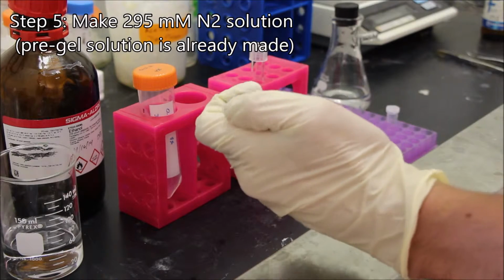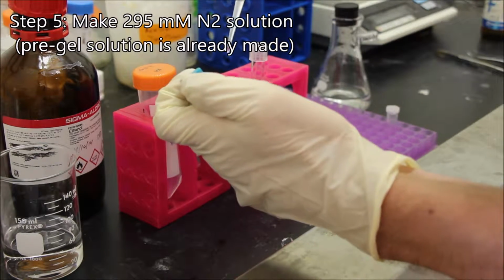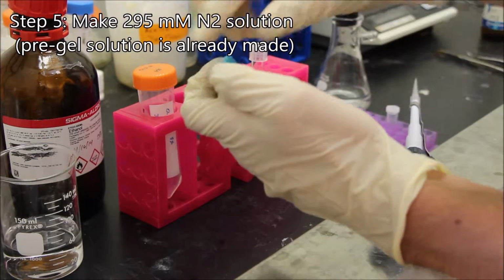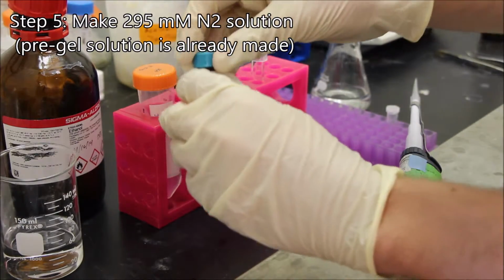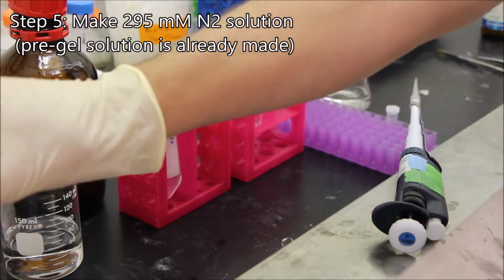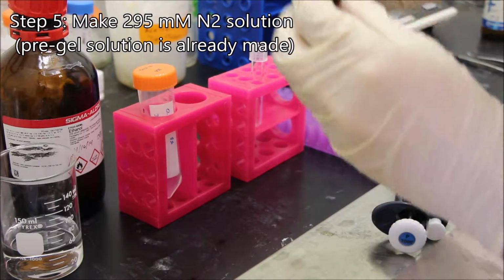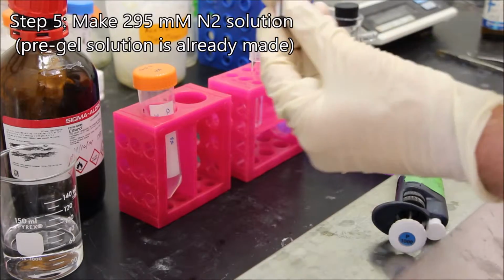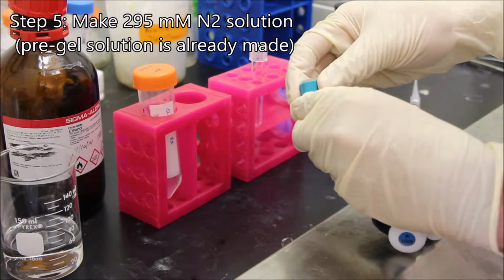And gently take it, tighten the cap, I'm going to briefly vortex it, and then, I don't know if you can see this, but it's not fully solubilized. To ensure that it goes completely into solution, I will now sonicate this for 2 minutes.